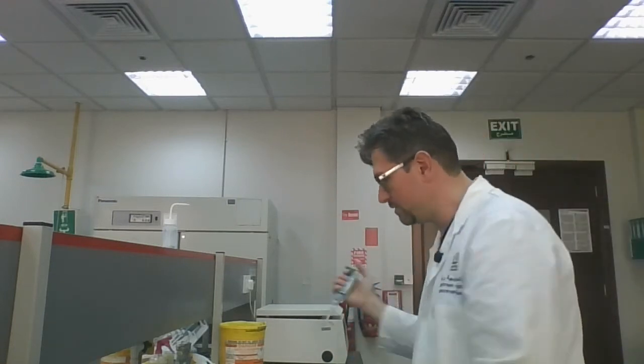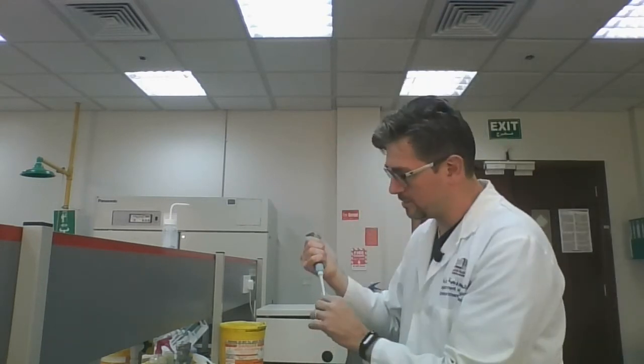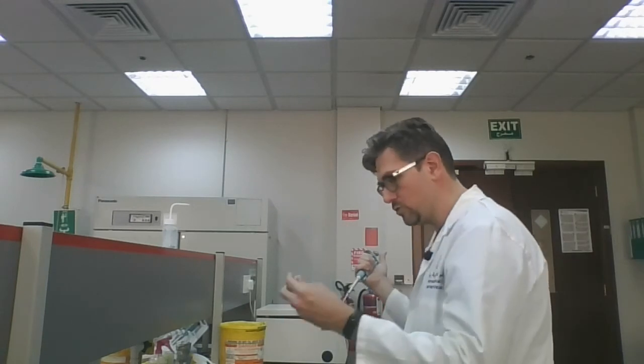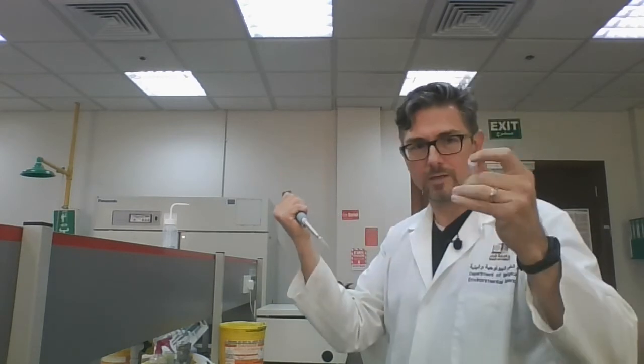Okay, so again, I will do the same thing with the other tube. Take 200 microliters of solution B and add it to the other tube. And again, mix it up.